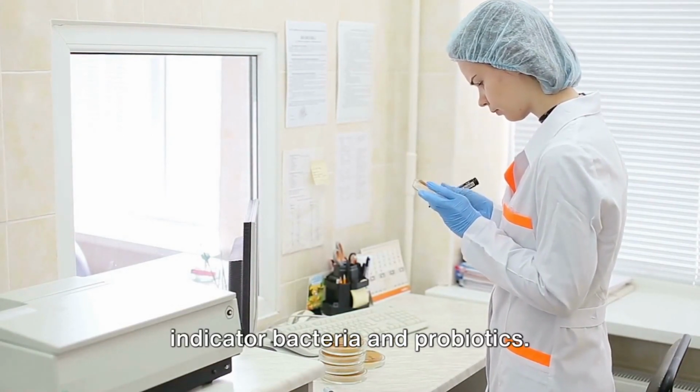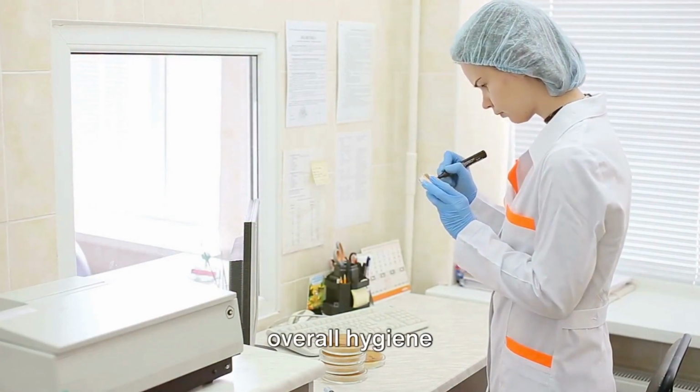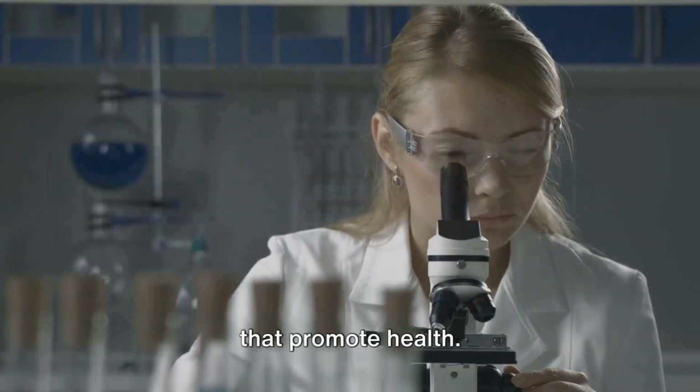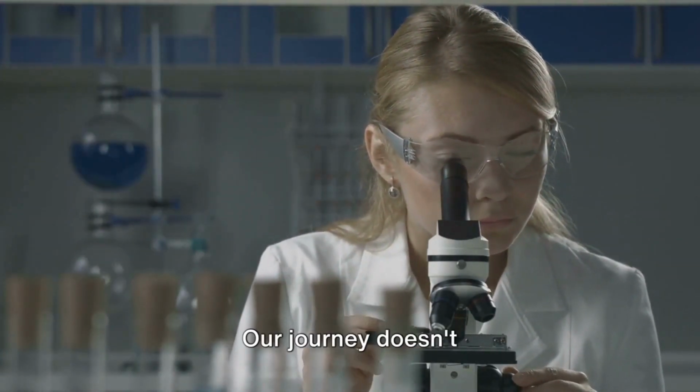We also identify indicator bacteria and probiotics. Indicator bacteria tell us about the overall hygiene condition, while probiotics are beneficial bacteria that promote health. It's like distinguishing the heroes from the villains in our microbial saga.